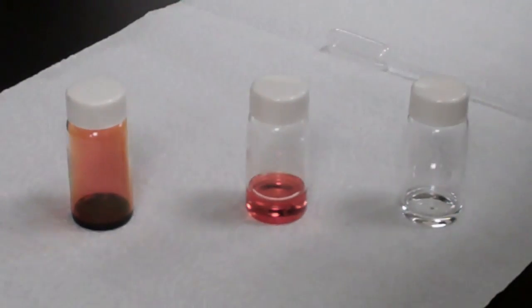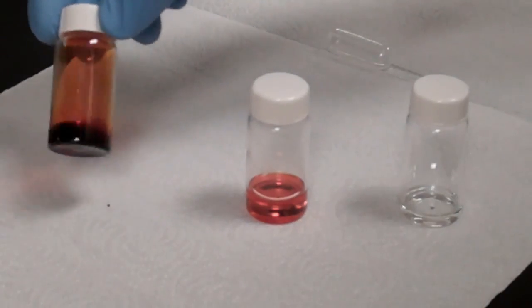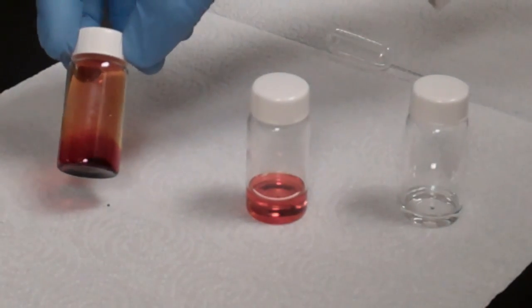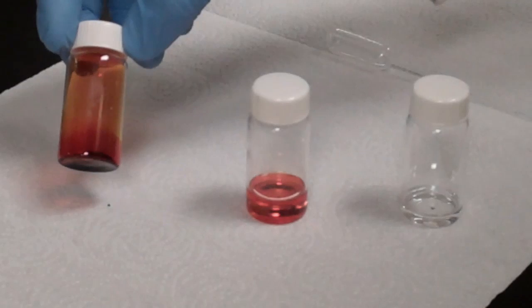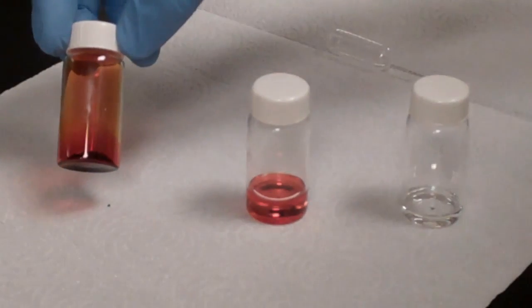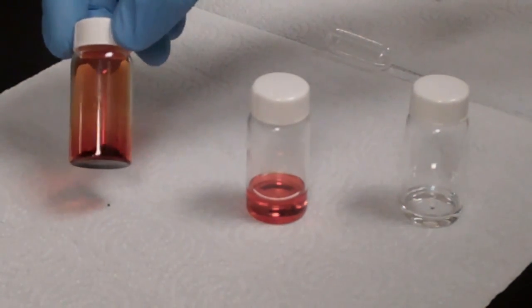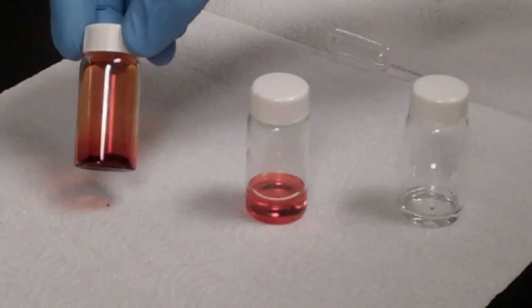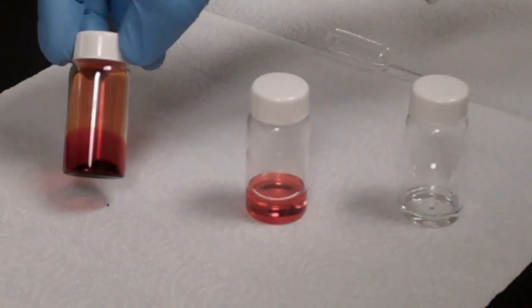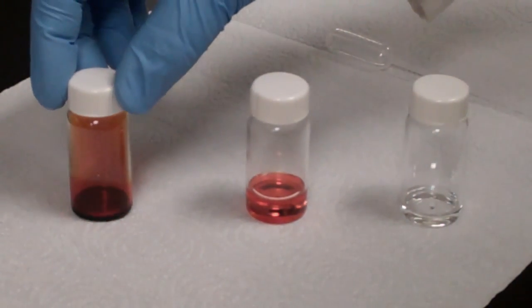So as promised, we're back in the lab. We're going to show you a bromine test, but first I want to show you, this is a concentrated solution of bromine. You can see how red that is. It's almost a reddish brown. You can't really see through the liquid at all. You can also see there's some bromine vapor above the solution. So bromine's actually quite volatile and quite toxic in the concentrated state, and so we don't want you working with that directly.